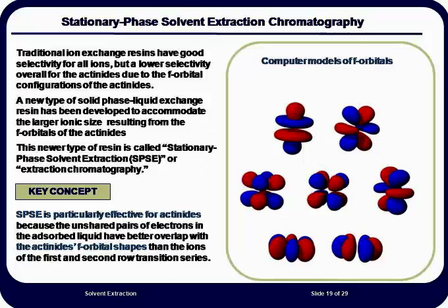This process is one by which an organic chelating agent is sorbed onto the surfaces of an inert ion exchange resin bead as a very thin film. The organic compound is a high boiling point liquid, or potentially a solid material that has an extremely low solubility in water or in acid solutions. The application of the organic compound as a thin film throughout the resin bead allows a tremendous increase in the surface area contact between the aqueous phase and the organic phase. It is far more effective than trying to force two immiscible liquids into tiny droplets by mechanical shaking.